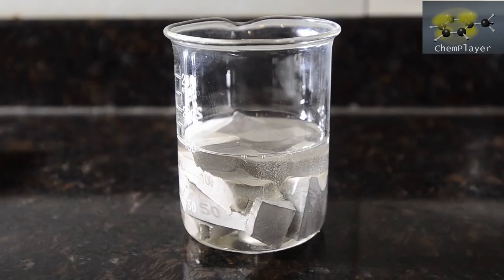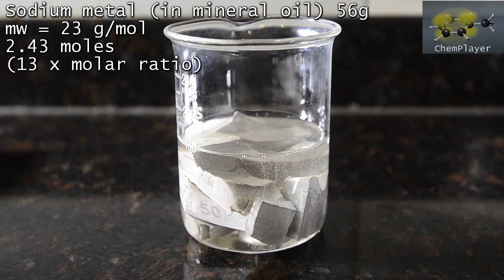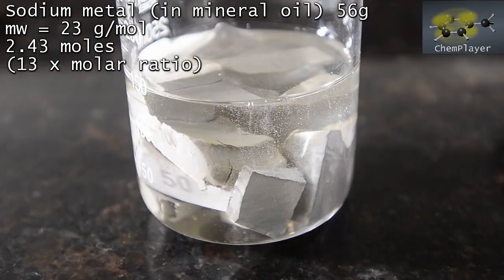And here it is. The whole 56 grams of sodium metal chunks. We pre-weighed it and then put the lumps of metal into the beaker with some dry mineral oil to protect it from atmospheric moisture. You can see there are a few bubbles coming off, so maybe our mineral oil isn't as dry as we thought.